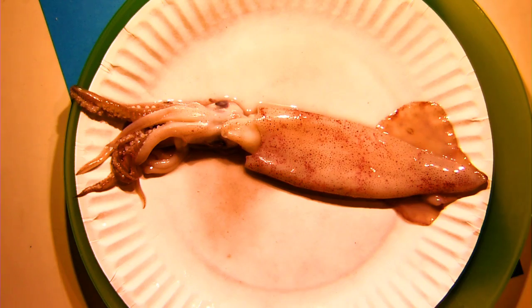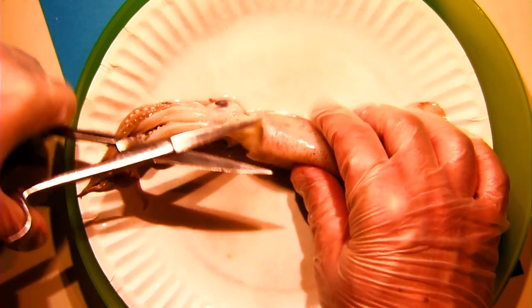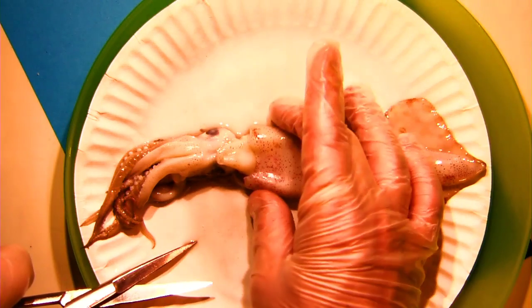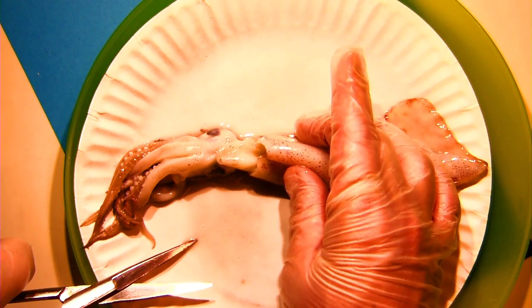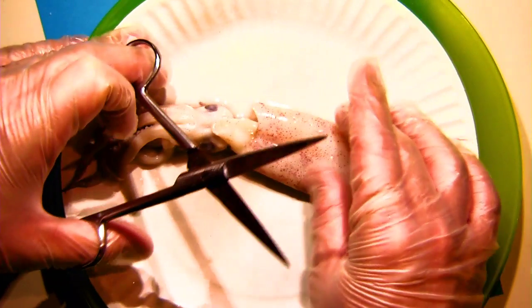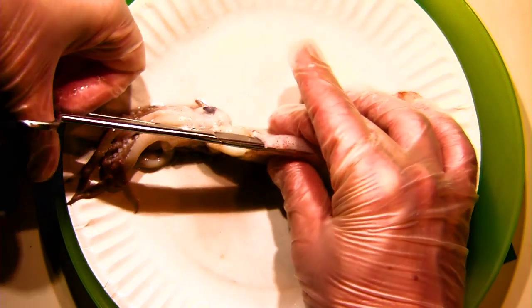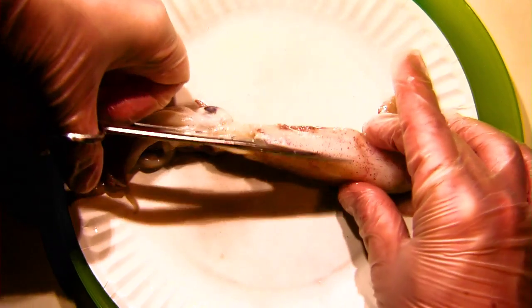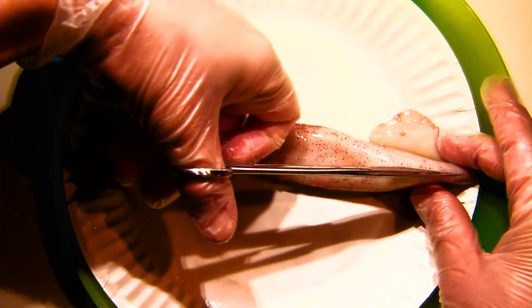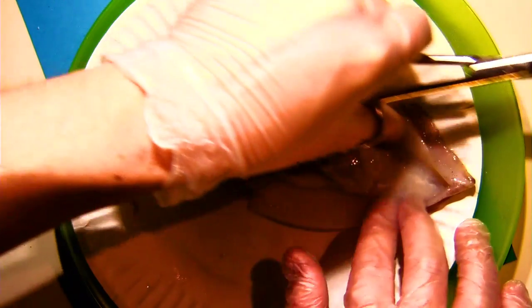To do this dissection, it's pretty simple — one of the simplest you can do. We're more or less going to make one big cut and then a couple of smaller ones later on. We're going to open up the mantle, starting right above the siphon. I'm going to put my scissors in and lift as I cut. It's always important to lift when doing any dissection so you don't cut up the organs inside — that way you won't cut up the stuff you want to look at.